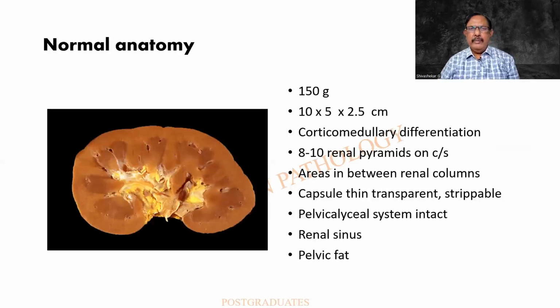The normal anatomy. Always be familiar with the normal. You are going to be thrown innumerable questions by the examiners at the normal stage. I have tried to round off the values as much as possible. 150 grams is the weight, can be a little more or less starting from 135 grams.